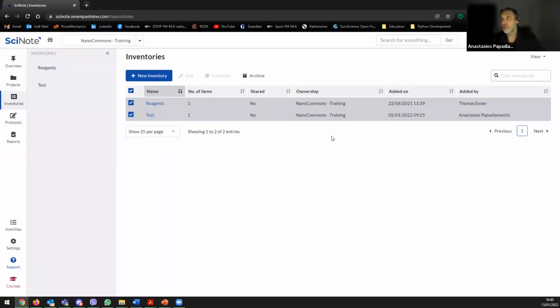But I believe we will be moving towards the local installation, so as to remove any limits in what we can do, create, and so on.